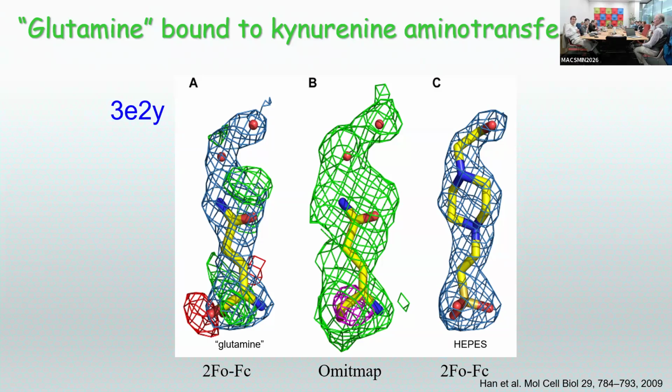So, that's not very unusual, that you expect a ligand and you find your buffer molecule instead. But again, you should be fairly careful in verifying. Just because you know that something should be there, don't say that it is there if the data say otherwise.